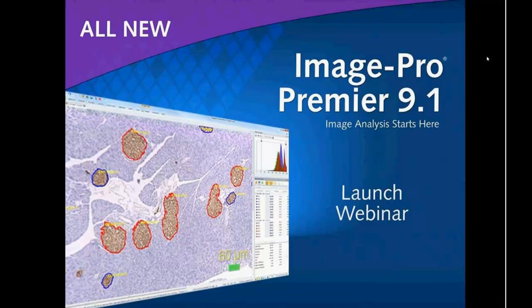We're very pleased to have a few moments of your time today to show you the latest in image analysis technology. My name is Nick Beavers, and today I'm joined by my colleague Jeff Knipe.